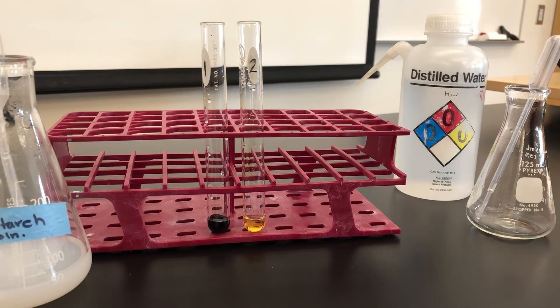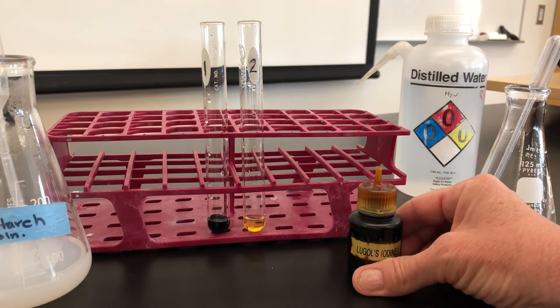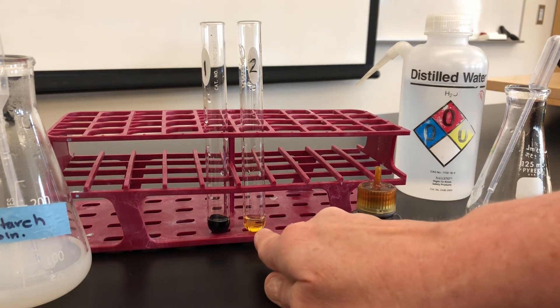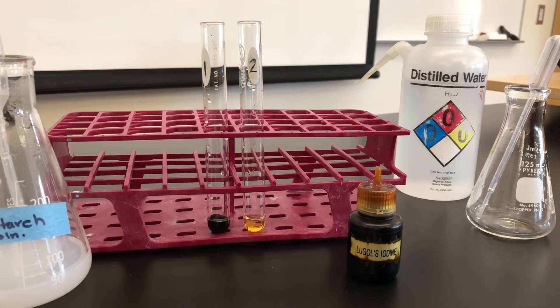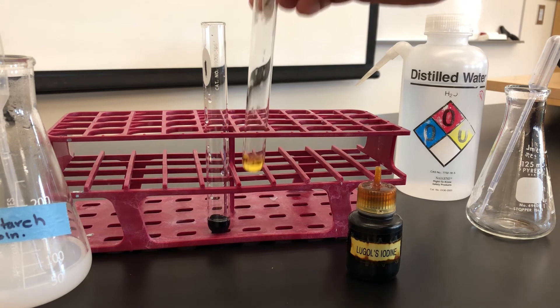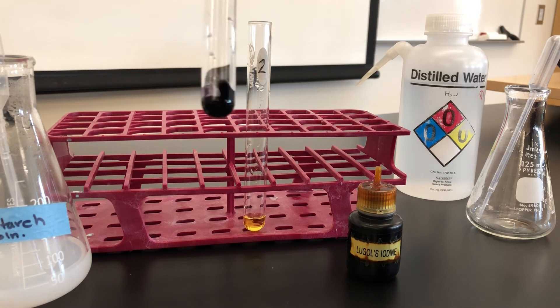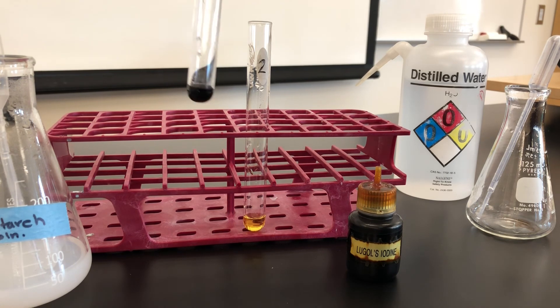Note the color. Iodine on its own is this kind of amber-yellow color. Notice with water, it stays the amber-yellow color. But when starch is present, it turns this kind of blue-black inky color. That's how you test for starch.